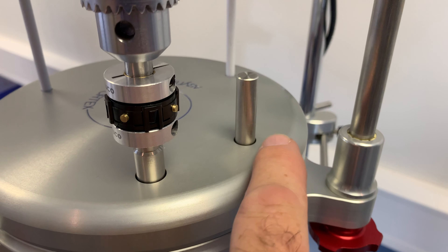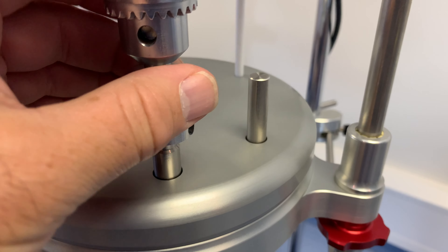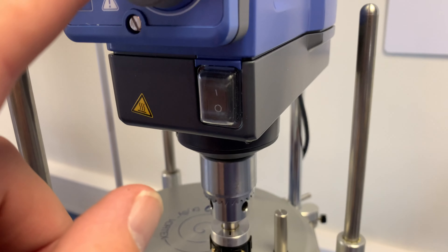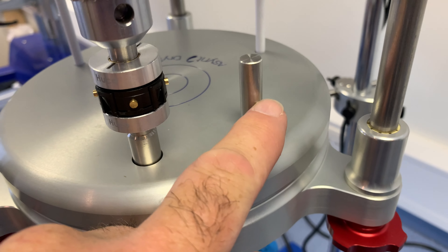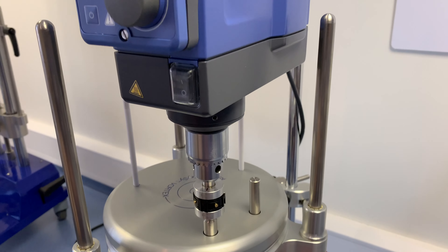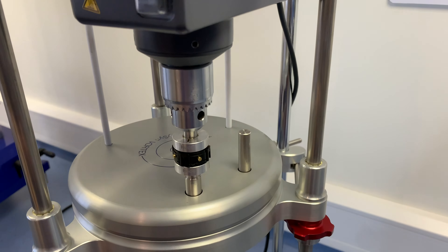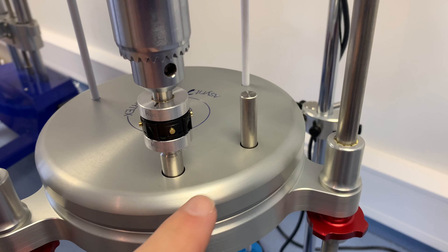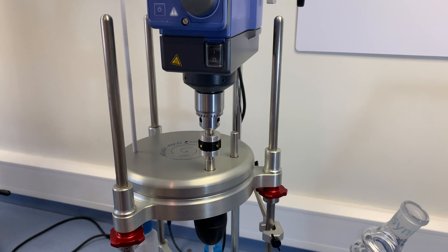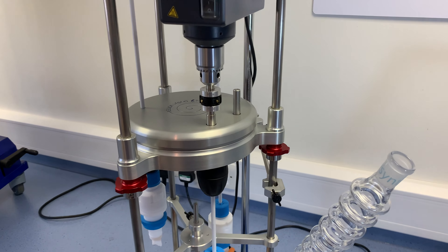There are two shaft inputs. The first is a direct drive, so the speed the stirrers run at will be identical to the stirrer motor. The second shaft runs at half speed. The reason for that is you could use a lower cost or lower power stirrer motor and still be able to stir three flasks with viscous materials. So if you set the overhead stirrer at 500 rpm, the flasks will be stirred at 250 rpm but with a lot more torque.